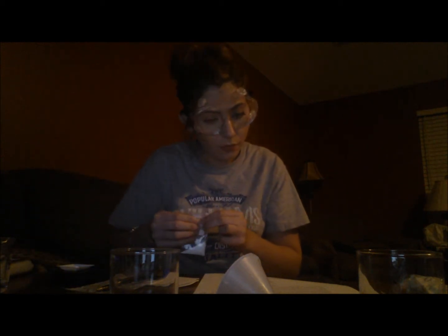Okay, so I got 0.7, which is pretty close. I don't have a paper cup, but I do have a glass cup. I'm going to add 25 mLs of distilled water to this. So we're going to fill this up again.